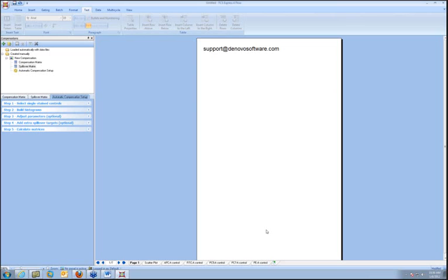So that's one of the reasons why people have moved to doing the compensation in software. The other reason is people find it just a preference. Maybe doing it on the instrument, machine time is expensive, and they don't want to sit there fuddling around with the compensation, so they just get their compensation controls and then they do all the compensation offline. So it's sometimes an issue of personal preference, and sometimes an issue of you want to check the compensation that other people did. Sometimes it was done wrong on the instrument and you want to correct it. So there's many different reasons.